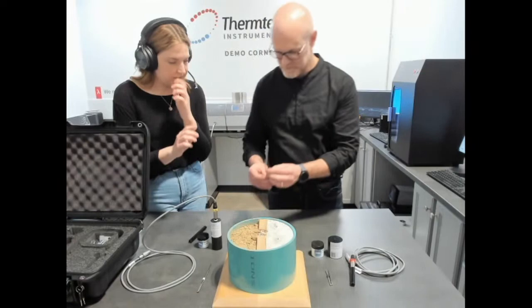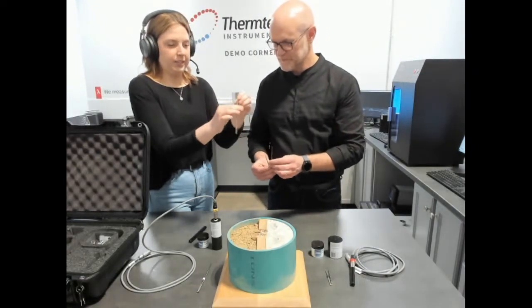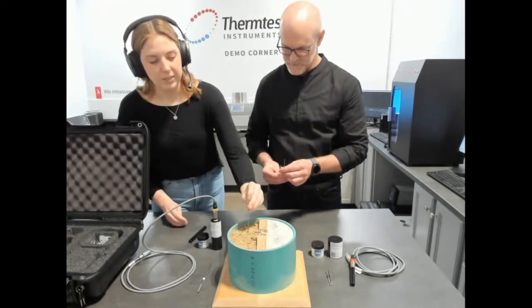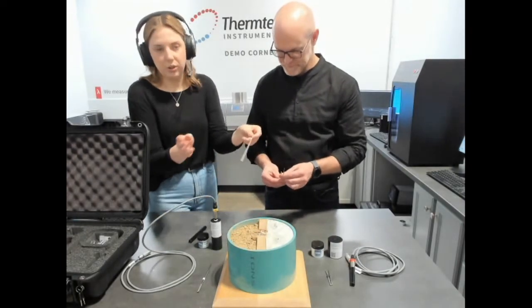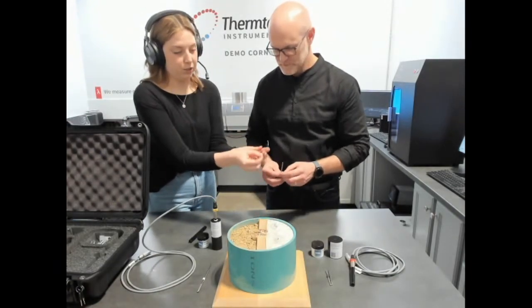With the TLS 100 we also have some accessories that come along with it. We have this insertion aid to assist with inserting our needle into samples, just to protect it from damage. We can insert that first and then remove it and insert our needle right afterwards, so that the needle doesn't get damaged.